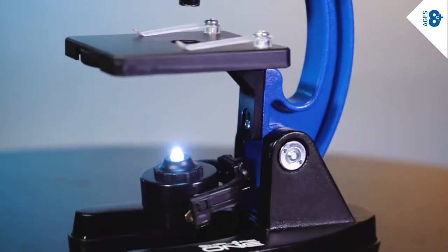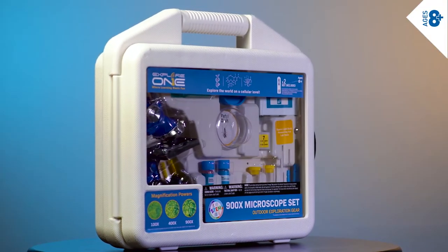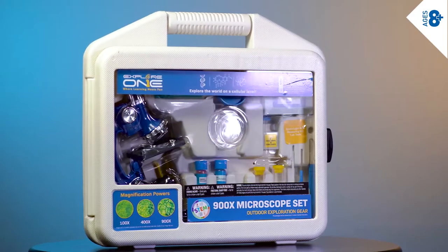The Explore One 45-piece 900x microscope set gives young scientists everything they need to begin exploring the hidden microscopic realm.